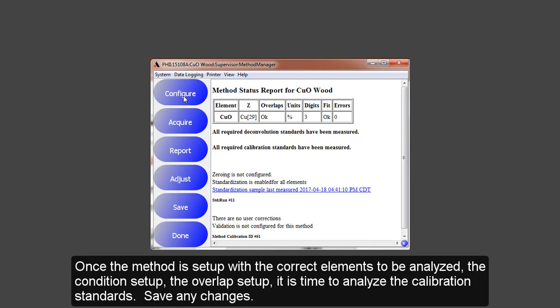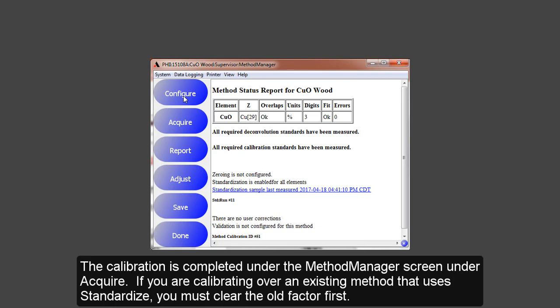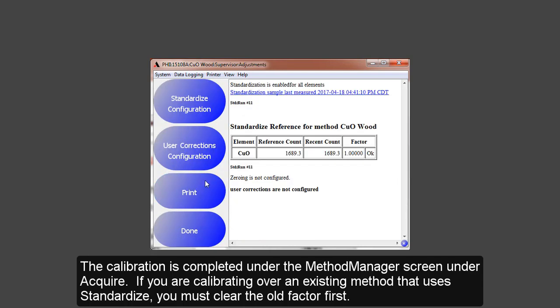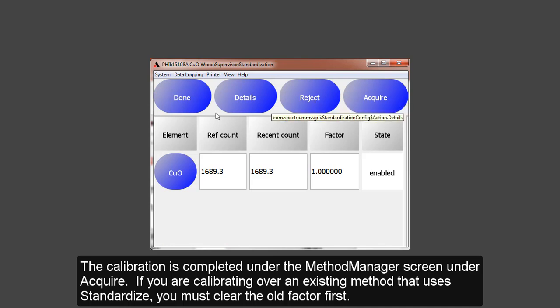Save any changes first, and the calibration is completed under the Acquire option. But remember, if you are calibrating over an existing method that uses standardized, you must clear the old standardized factor first by selecting Adjust, then Standardize Configuration and Reject.